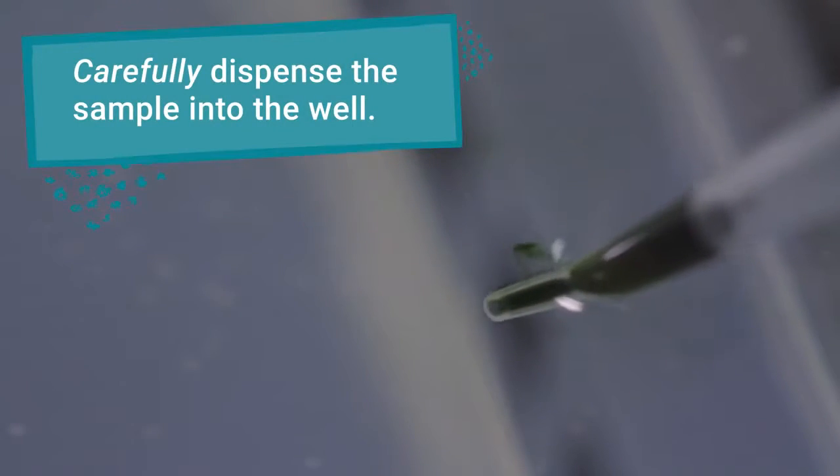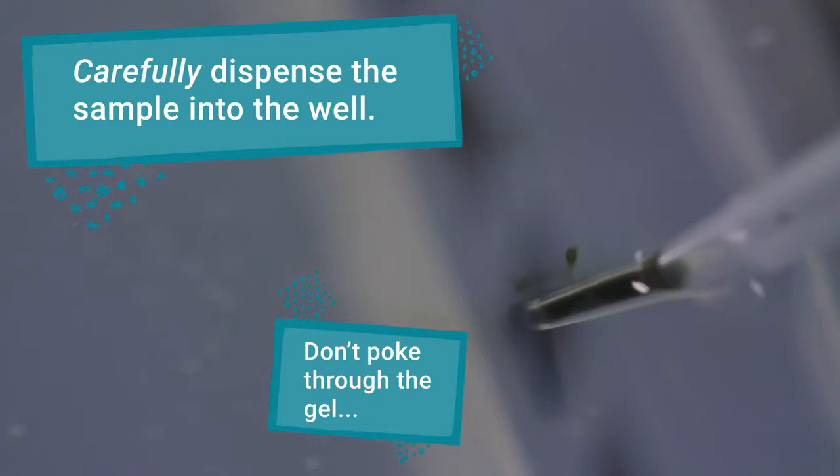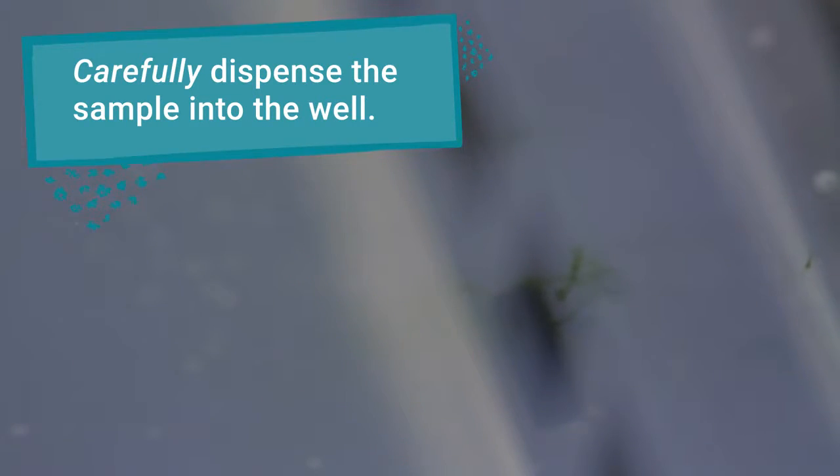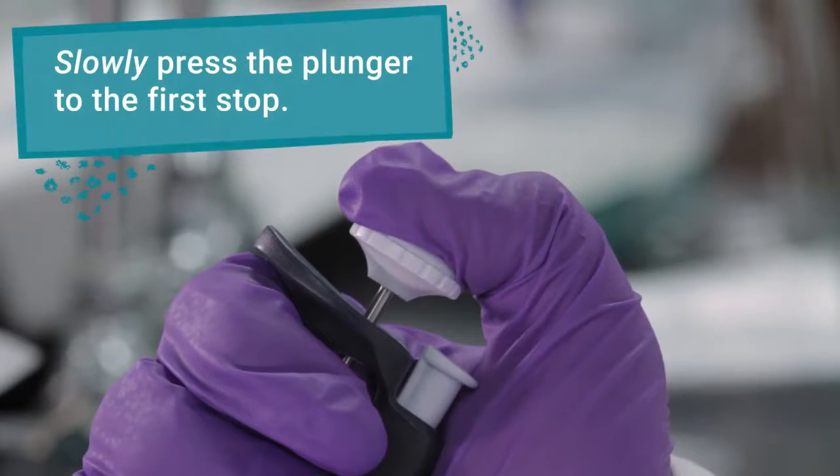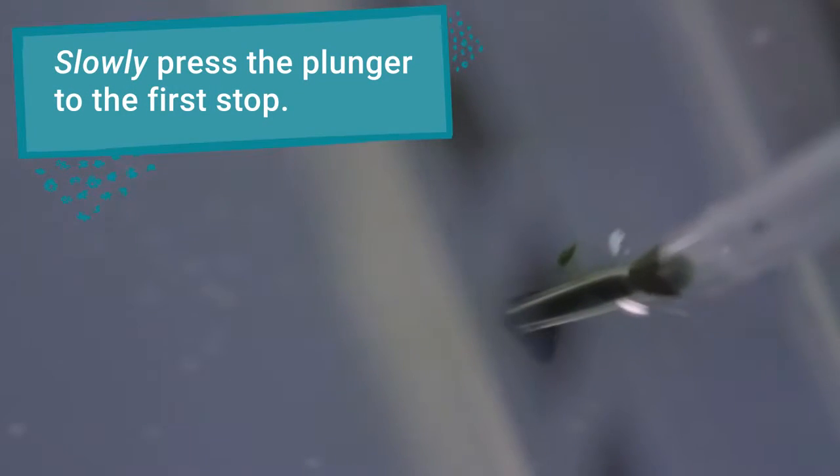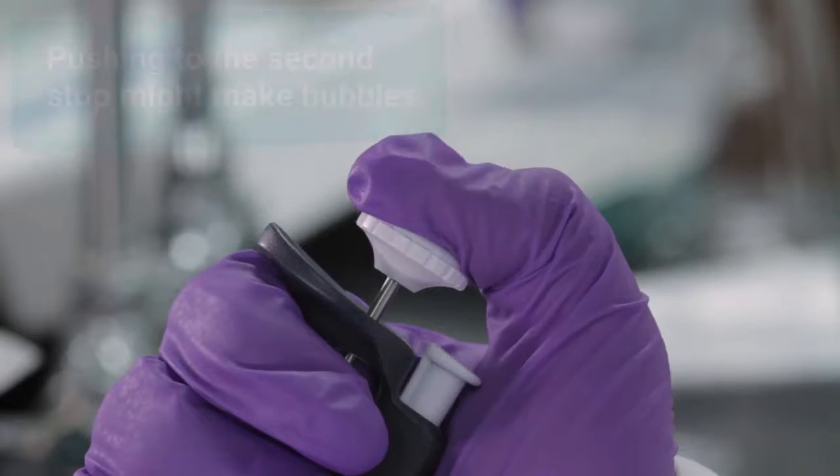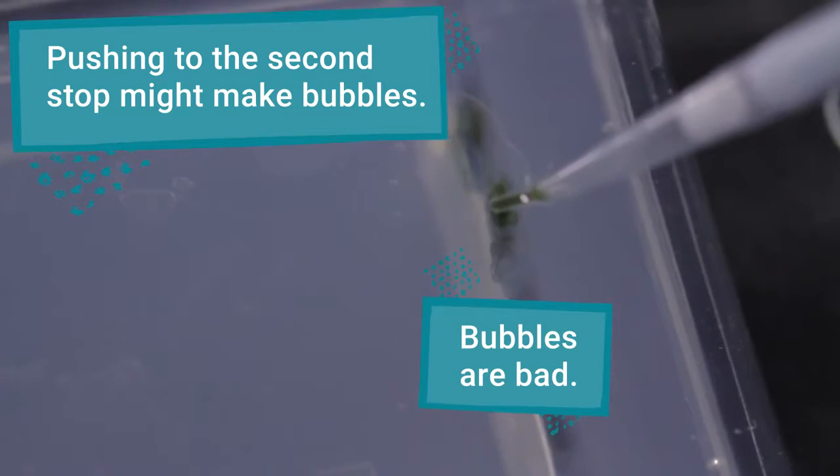Carefully insert your pipette tip into the well that corresponds to your sample. Make sure you don't poke into the bottom of the gel or leave the tip floating above the well. Slowly push the plunger to the first stop to fully dispense the sample into the well. Going to the second stop can introduce bubbles, which can push your sample out of the well.